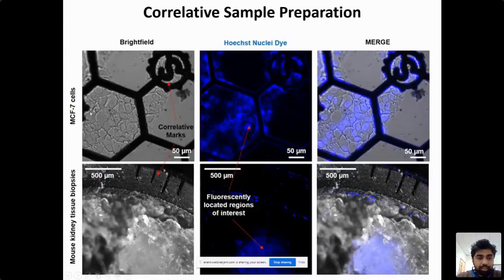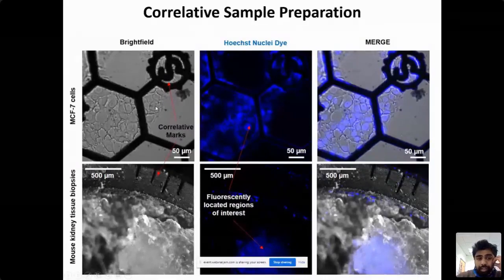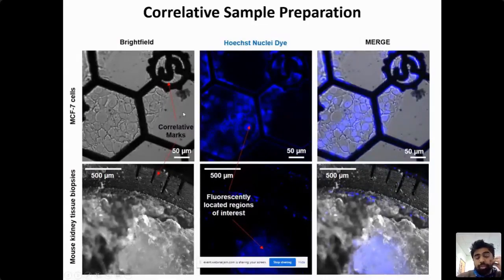So for cells and vesicles, for example, what I do is culture my cell samples on grids, or put my nanoparticles on these correlative grids. You can either purchase them without a film, and then manually add the film. For example, I've added a Formvar film, or we can purchase it directly as a carbon-coated film on which the cells can grow. And I usually treat with a substrate, for example Matrigel or polylysine, so that the cells are happily attached and growing.